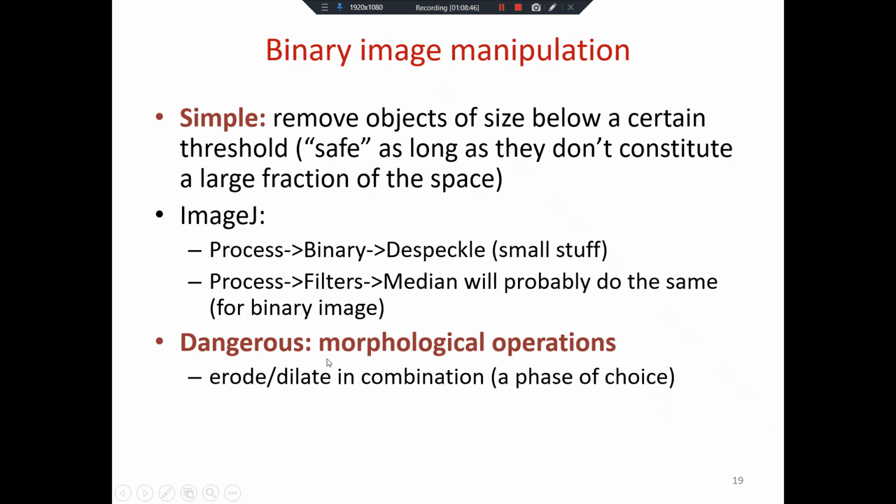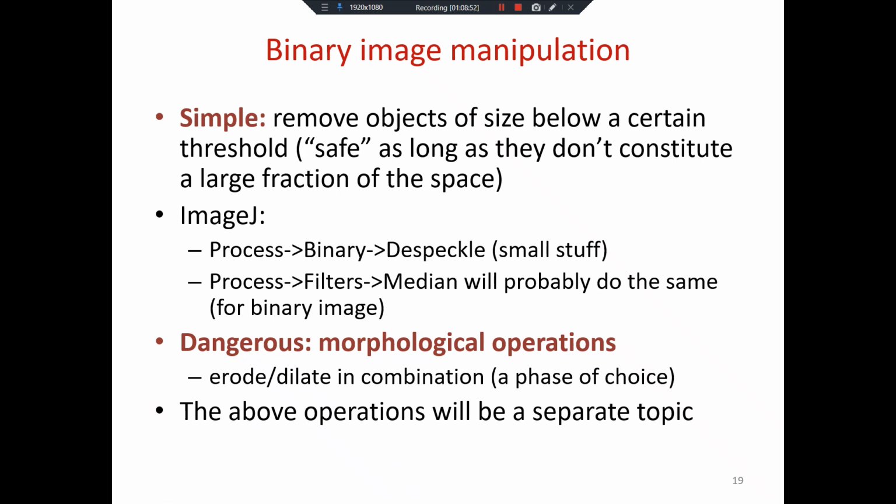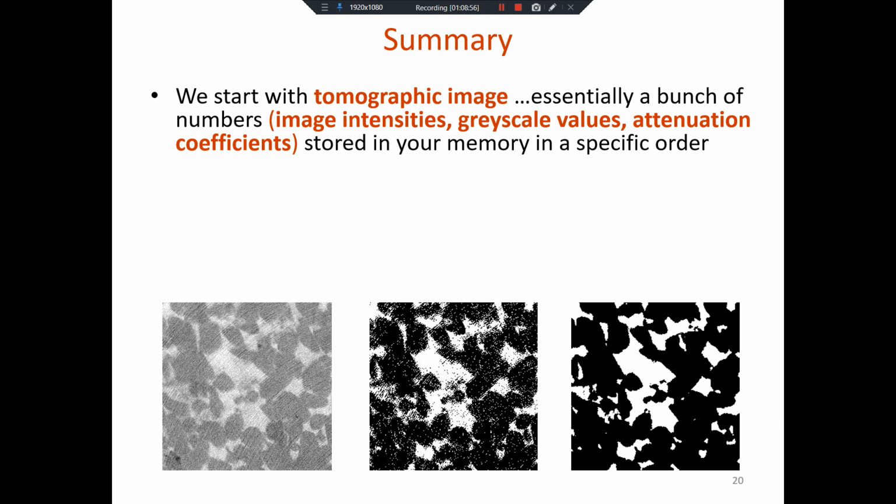We're going to do erosion and dilation later. Those are kind of dangerous because they can change your image a lot, and we're going to look at that. So that's going to be a separate topic.